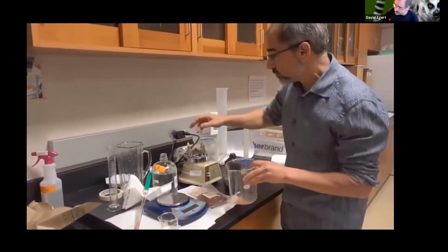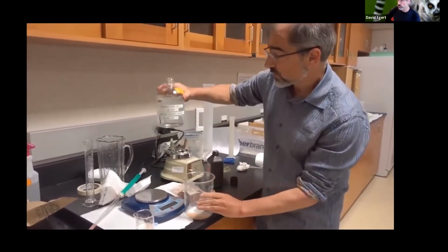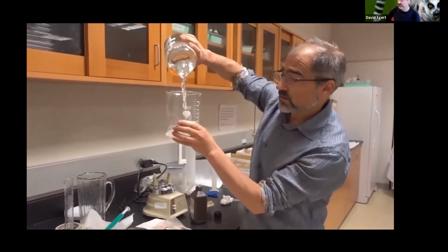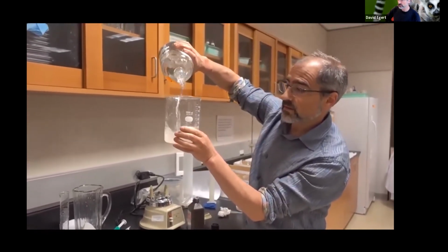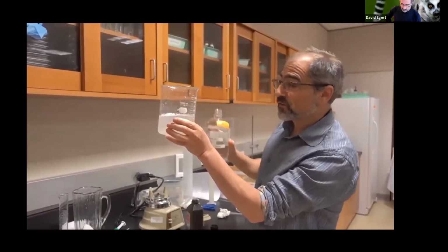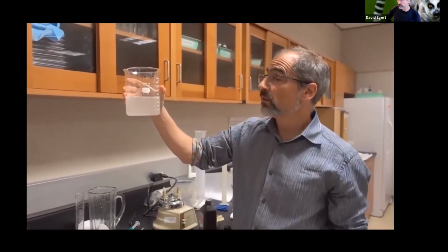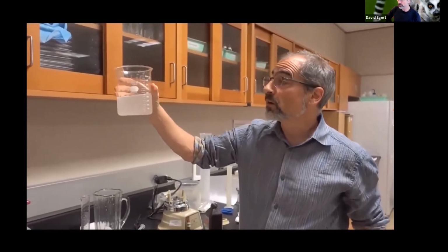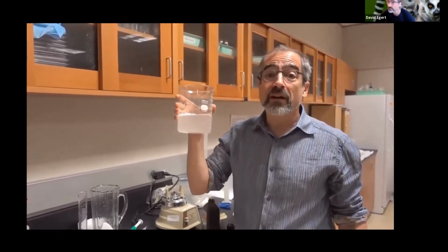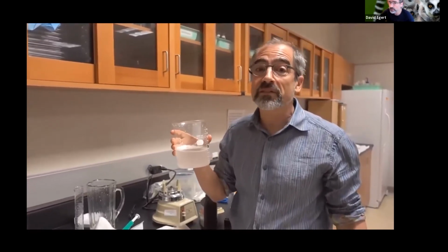I'm going to do a major dilution here. This is my phosphate buffer. And I'm just going to fill this up to about 450. So a little more than 100 to 1 dilution with water. And this might or might not be our ideal dilution. It's kind of hard to tell because every cow's liver is a little different.